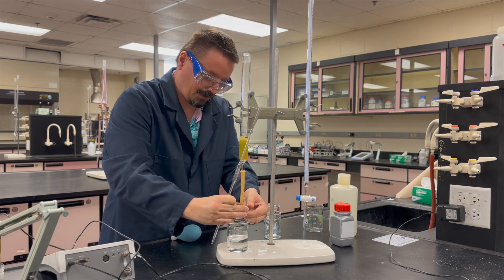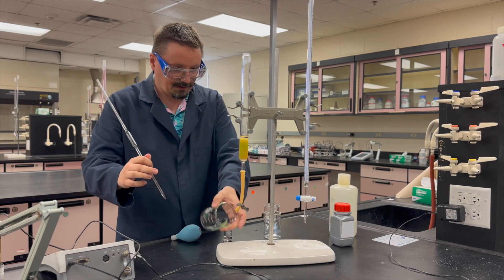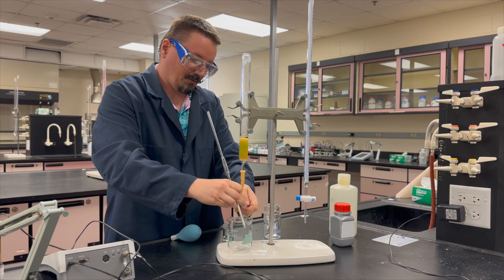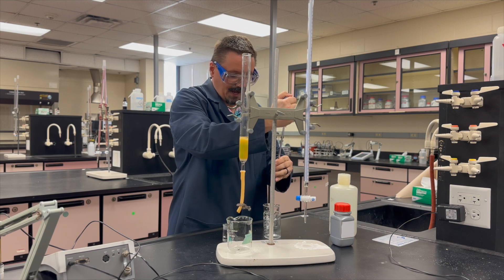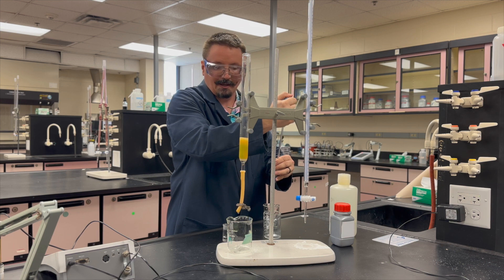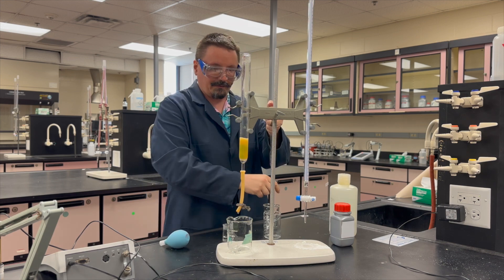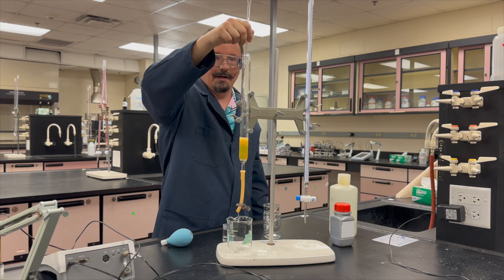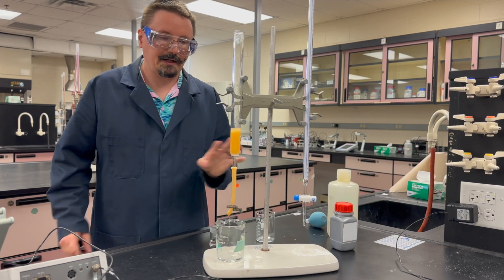Once the green band is near the bottom, stop, clamp the column, swap from the waste beaker to your empty collection beaker, then open it back up and begin adding water. Add the full amount of water specified. Even if you've added most of the water and no longer see the green band, keep adding and collect all of that water. You want to be 100% sure you've collected all of that cobalt out of the column and into that beaker before moving on.